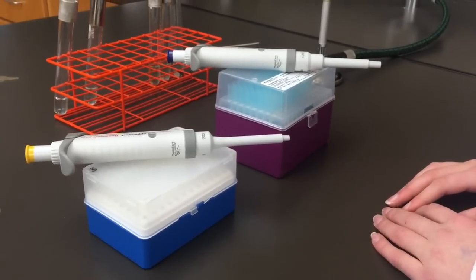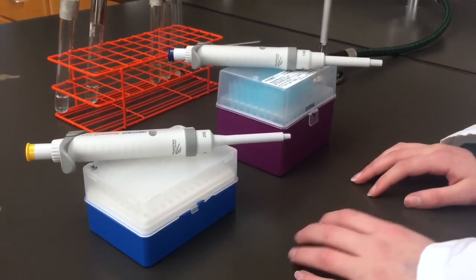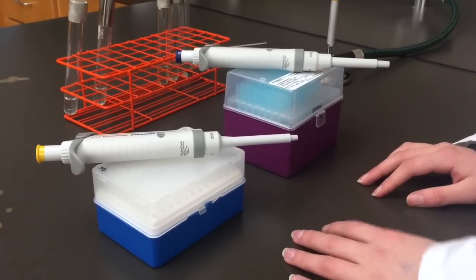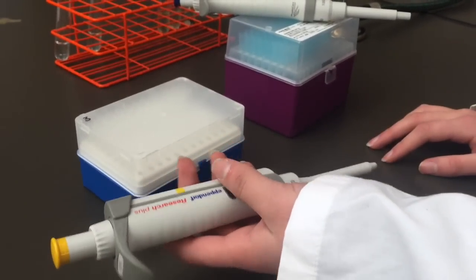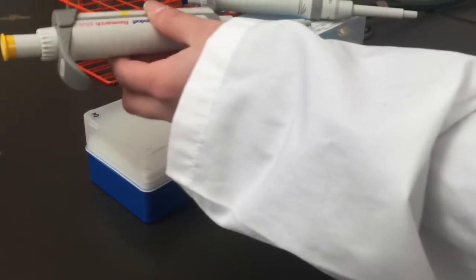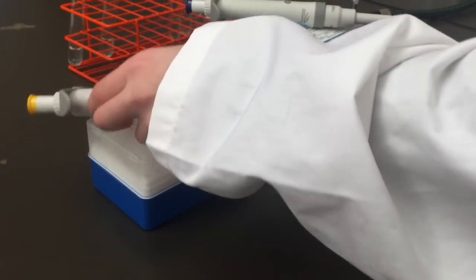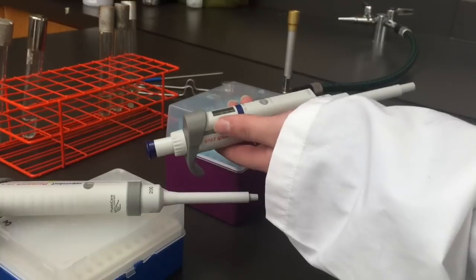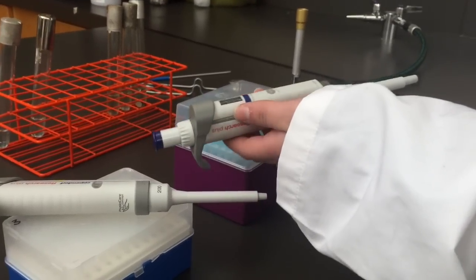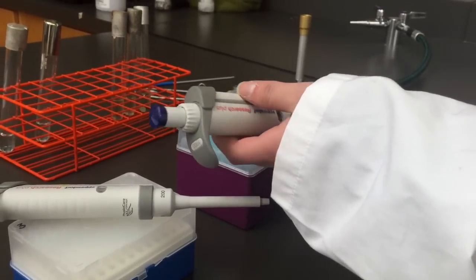Throughout the course of this experiment, you'll be using two different pipettes that transfer different amounts of liquid. For example, the P200 is good at transferring small volumes ranging from 20 microliters to 200 microliters, and is used with the smaller tips. The P1000 transfers larger volumes, ranging from 100 microliters to 1 milliliter, and is used with the larger tips.